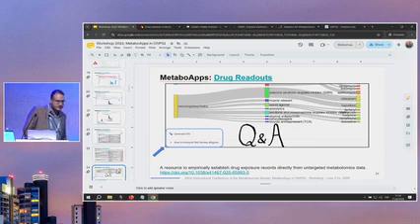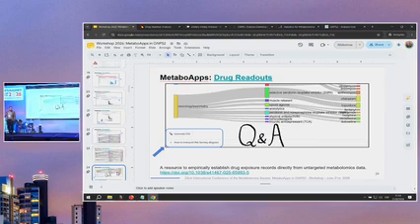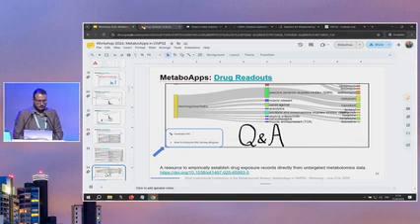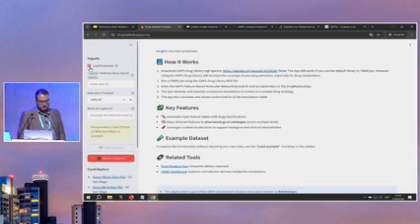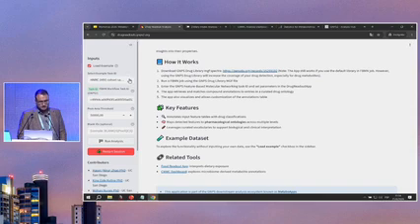Yeah, sure. My question was, what kind of raw data are you putting there besides the library? Is it the MS data, and which format is it? Is it compatible with this one, or do we have to put it in one software, then from that software generate that information and put it there? And then you showed something like features and libraries. How are we sure that these are matched with our own samples? And is it urine samples or any of those kinds of samples?